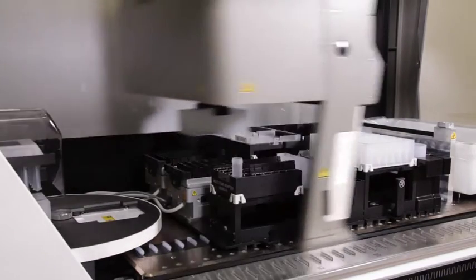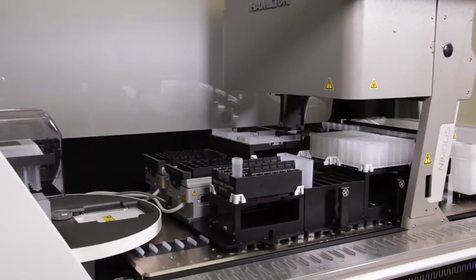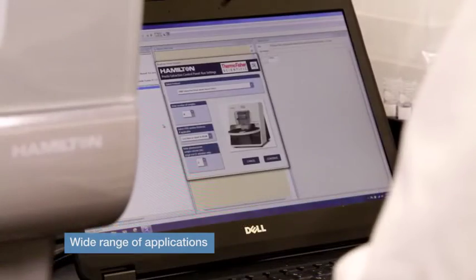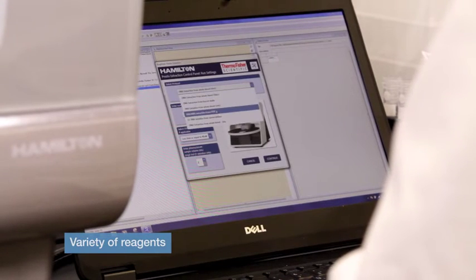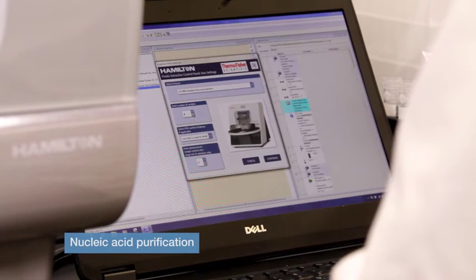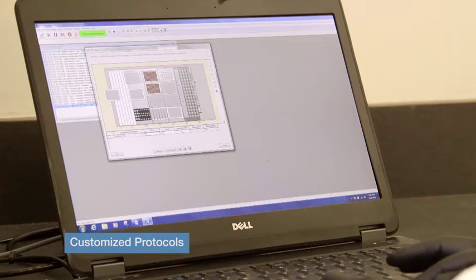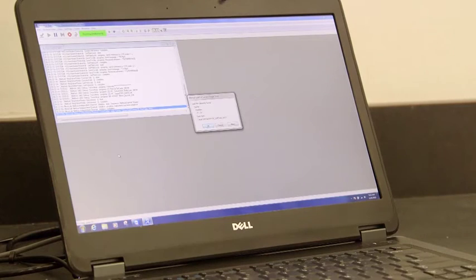The Kingfisher Presto system can be used for a wide range of applications and works with a variety of reagents, including Invitrogen and Applied Biosystems kits. Users can optimize their own protocols as needed for added flexibility.